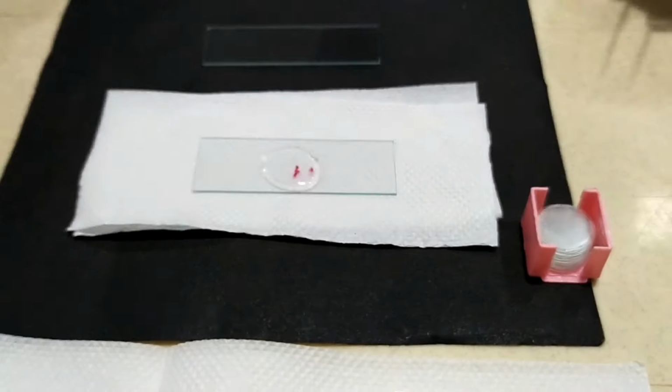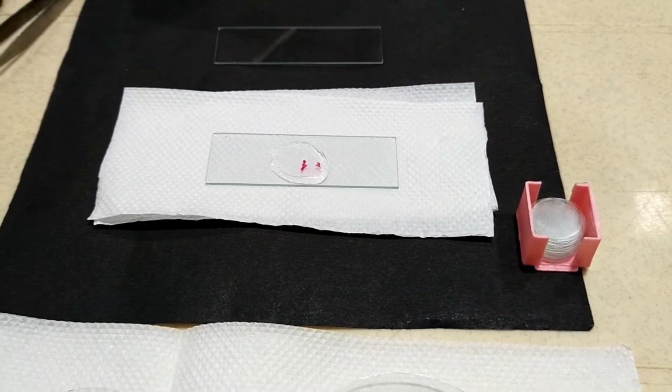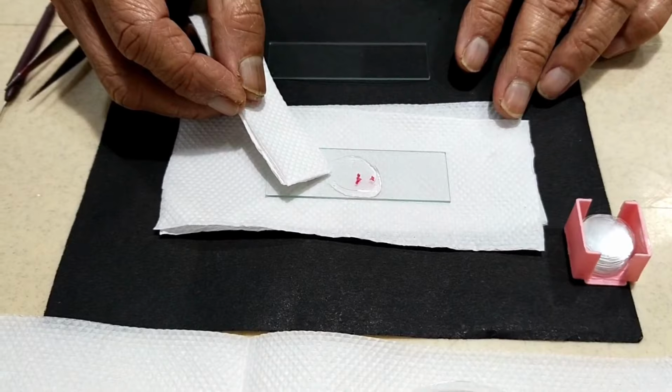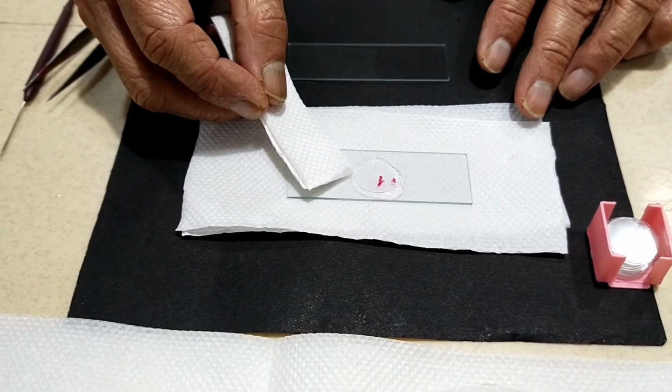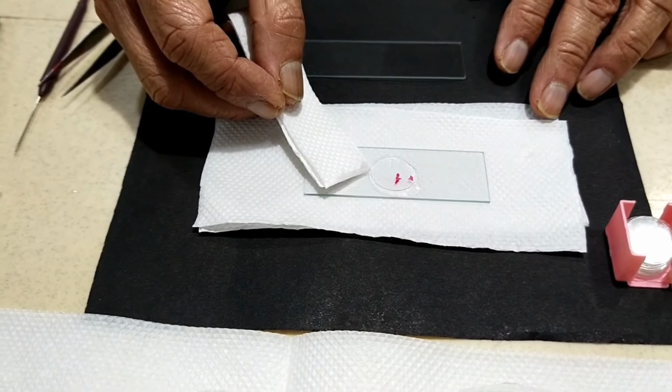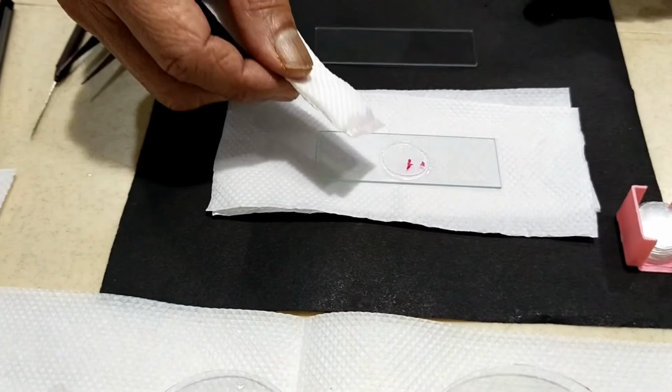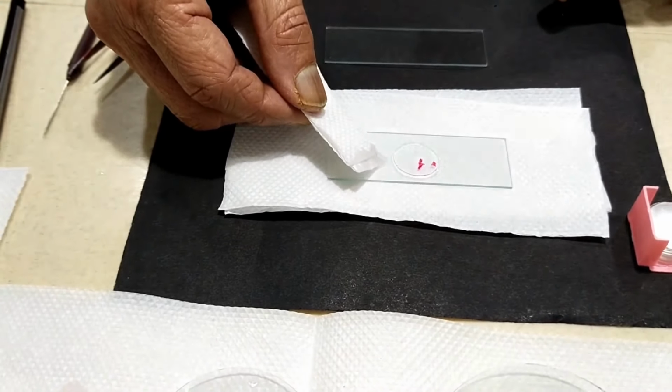See, that's it. And now that extra water can be removed. Just put a piece of tissue paper, a blotting paper. Allow some water to remain, but all extra should be removed.